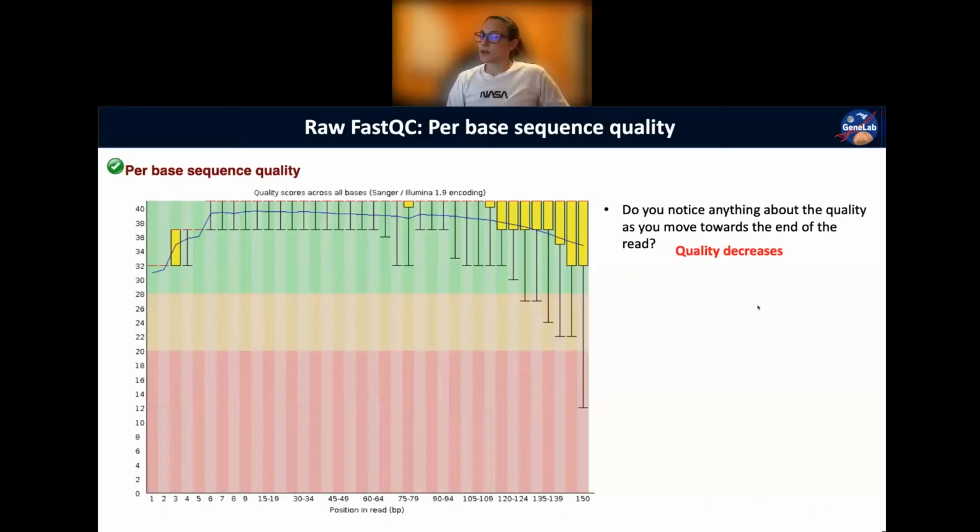It's kind of more so on the substrate side of things. Both, if you think about it, our cells are wonderfully suited, the perfect environment for polymerase to work optimally. Polymerase is the enzyme that we're using here to synthesize our sequence in the sequencing by synthesis reaction.